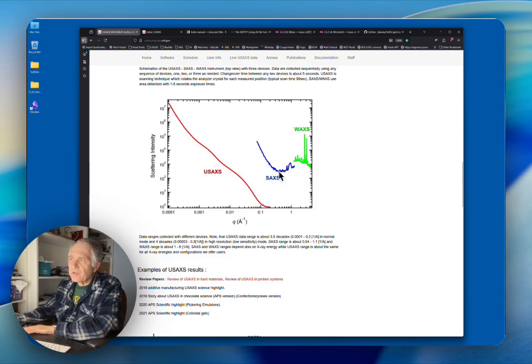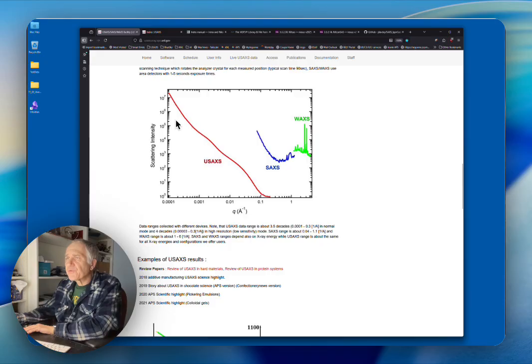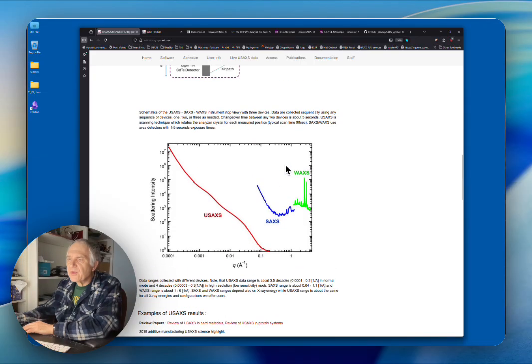Then we have a SAXS instrument, which typically measures from about 0.03 to 0.05 at low Q and goes to about 1.1 inverse angstrom. So it covers the higher range of the SAXS region normally. And then we have the powder diffraction device, which gives you the standard peaks up to a d-spacing of 1 or less than 1 angstrom. So you get 3 different measurements during our data collection. And so with these 3 different measurements, you actually do generate multiple data sets. And this is where some of the issues with our instrument data are.